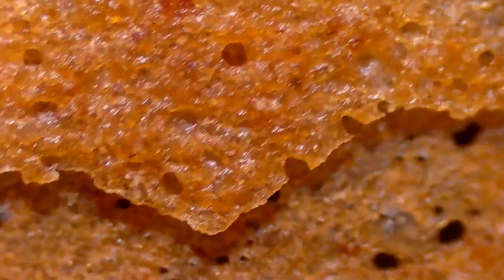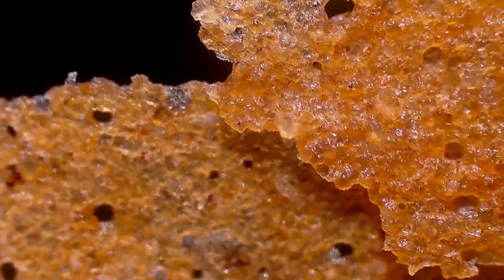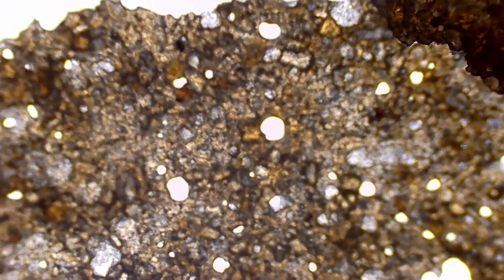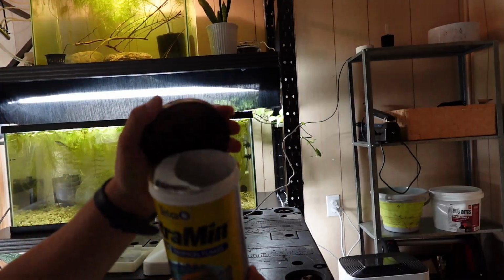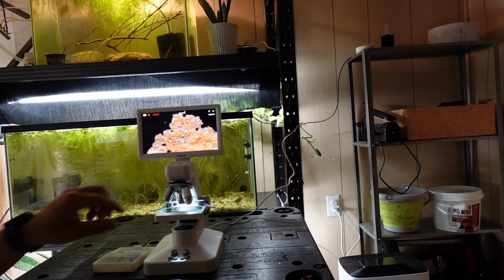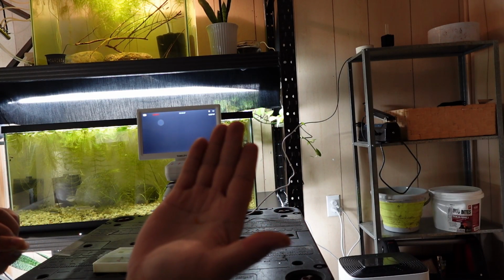So essentially it has an overhead light. Let me do the under light, the bottom light here, and then I can get a little bit better clarity. There we go. What do you guys think this is? If you guess fish food, you're right. It's actually one of these fish flakes here, just your common everyday staple food that you probably feed your fish. That's what this was here on the glass. Oh, it just slid off. Just a little piece of flake, if you guys can see that.